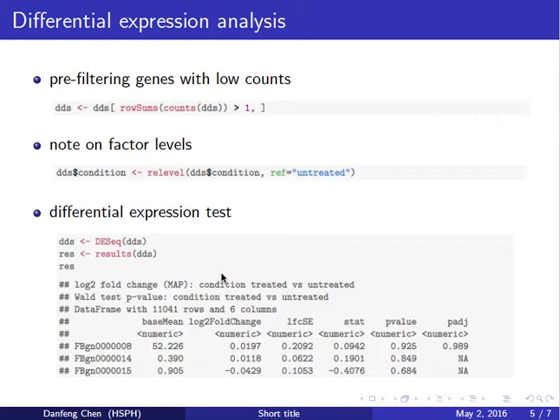Now I will tell you how to do differential expression analysis using the DESeq package. The first step is to filter the genes with low counts. While it is not necessary to pre-filter low count genes before running DESeq functions, there are two reasons which make pre-filtering useful. By removing rows in which there are no reads or nearly no reads, we will be able to reduce the memory size of the dds dataset object, and we will increase the speed of transformation and testing functions within DESeq.